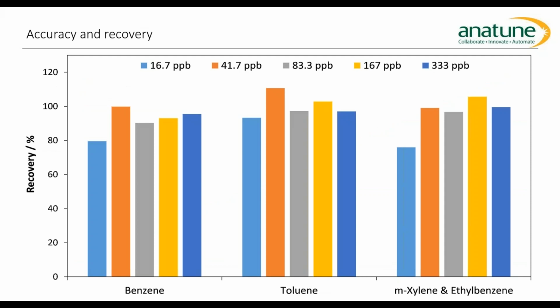And also just to show that the recovery is good across the entire concentration range, these are our percentage recoveries from that analysis. So somewhere between 80 and 110% recovery for each of those concentration spikes.